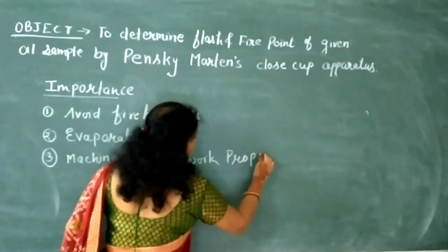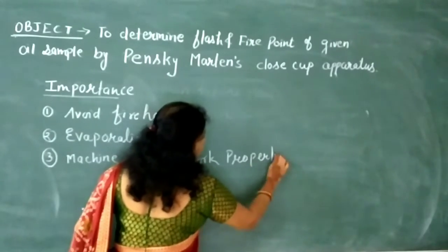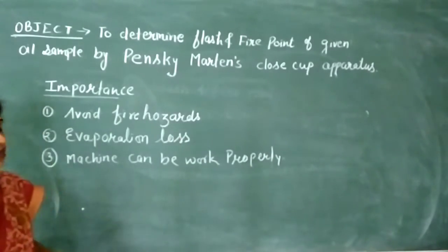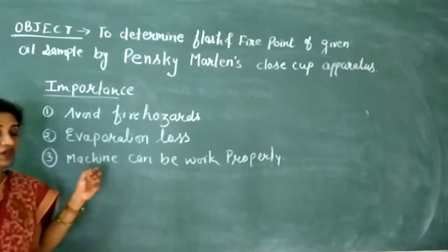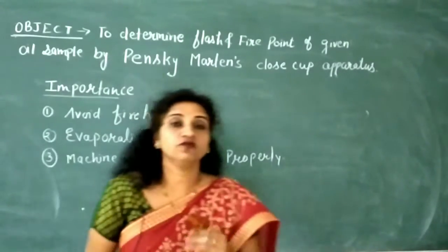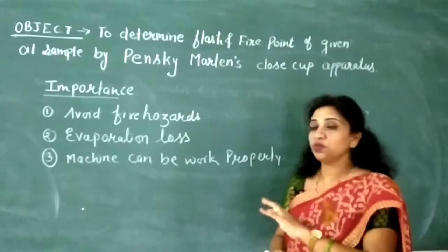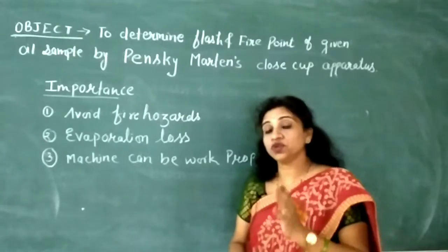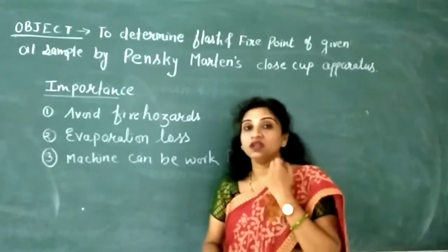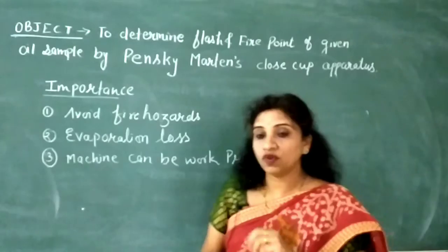That means when we determine the flash and fire point of any oil and then apply it on a machine, the machine can work properly without any hazards, without any evaporation loss, without any friction. So this is the importance of flash and fire point.